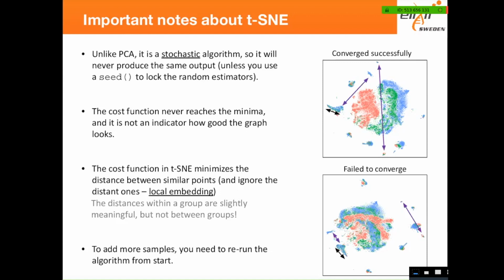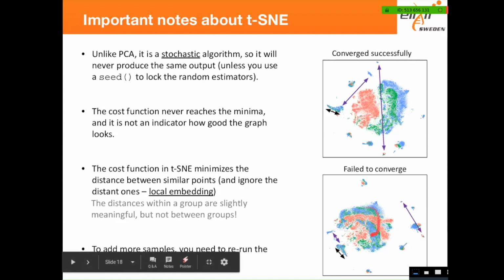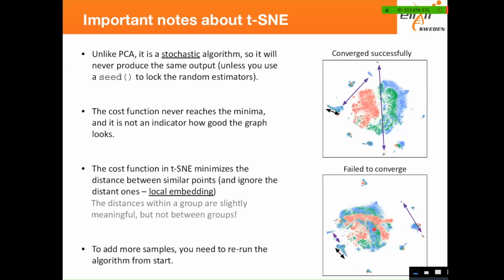Are the colors here not made by tSNE, right? No, the colors are 3 different samples. And I would expect them to be like this. And this one is just all merged together. It's just that it didn't have enough iterations to separate it. So yeah, that's it.